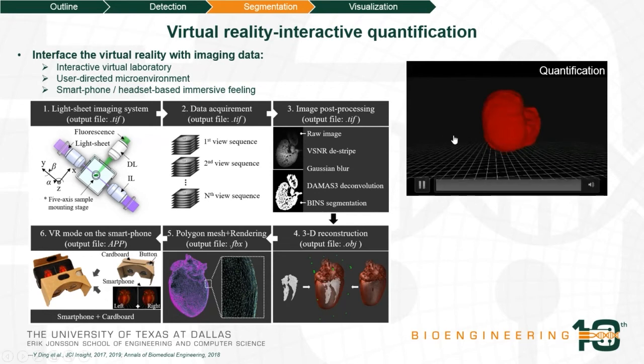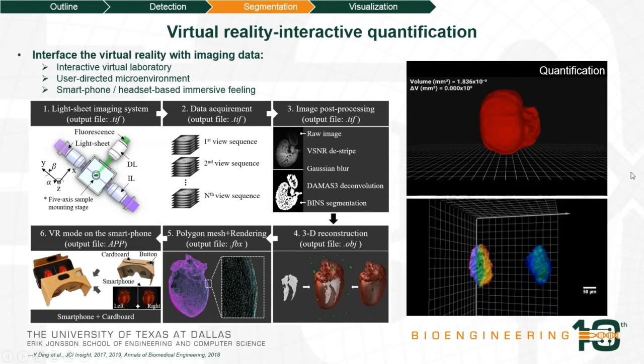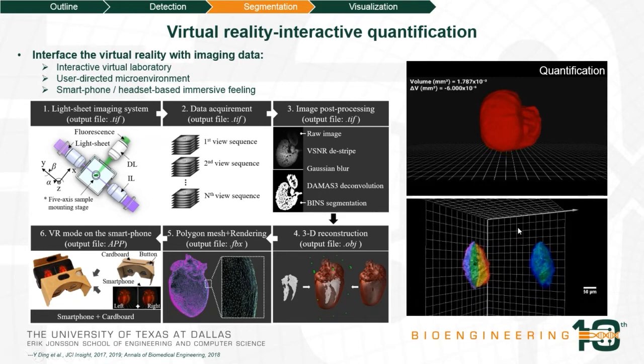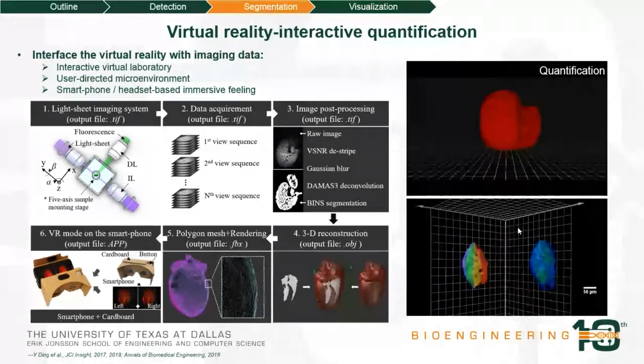We further use this contracting heart to demonstrate the feasibility of the interactive environment of volume change in a 4D heart, and it paves the way for us to integrate all our engineering methods with animal models in the future. We will further include our previous method of displacement calculation in this platform to generate a comprehensive and interactive strain analysis in the live animal models.